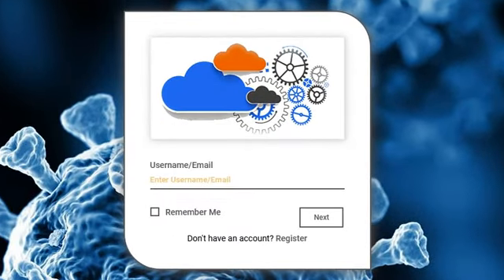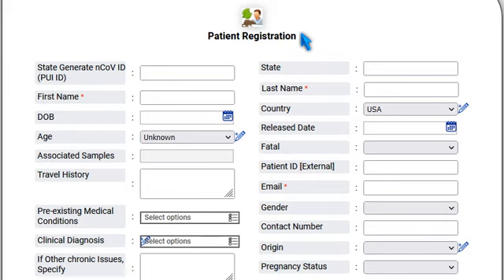portal with ease. A patient visits the website of your diagnostic laboratory and navigates to the branded patient portal set up by CloudLIMS. A new patient needs to register to access the patient portal. To register, the patient needs to click Register. The registration form opens. The registration form is configurable. We will demonstrate how to personalize the patient portal login page in a separate tutorial.